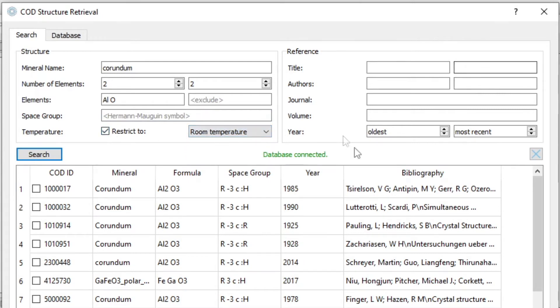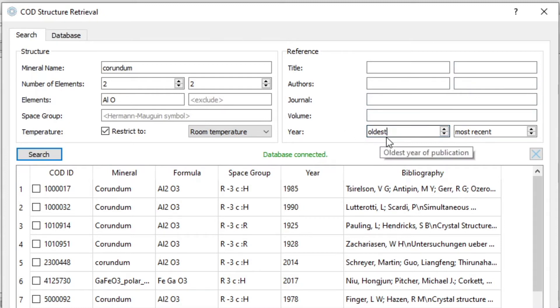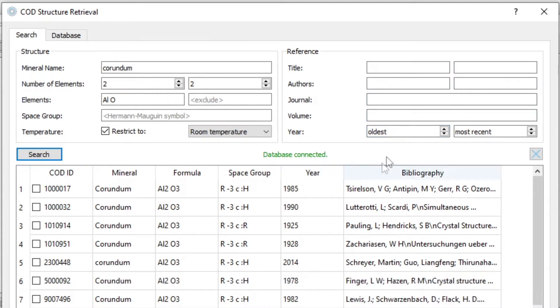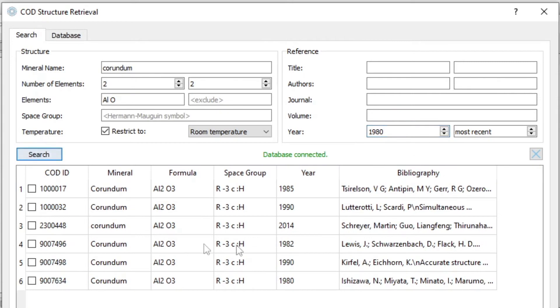We could also search by reference. If we know the title of the publication, we have two fields for words to search in the title, or we can search for two authors, the journal, the volume, or we can restrict the year of publication. For example, if we only want data sets that are newer than, let's say, 1980, we have a lot less.